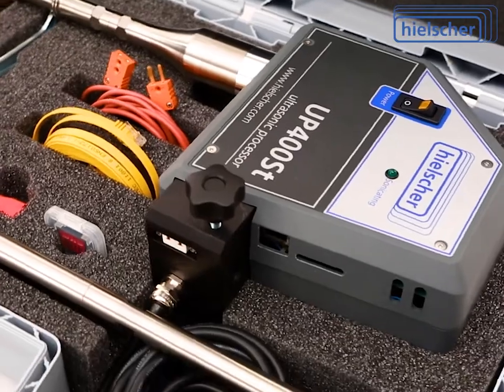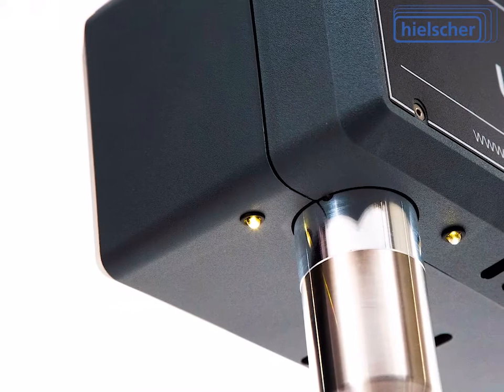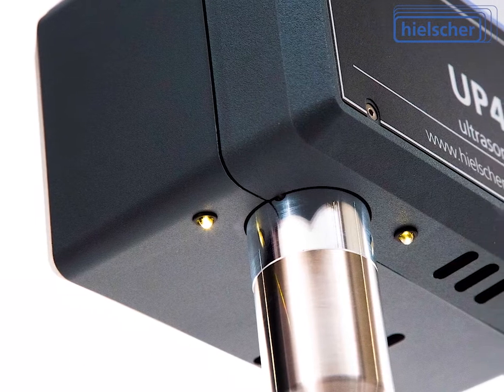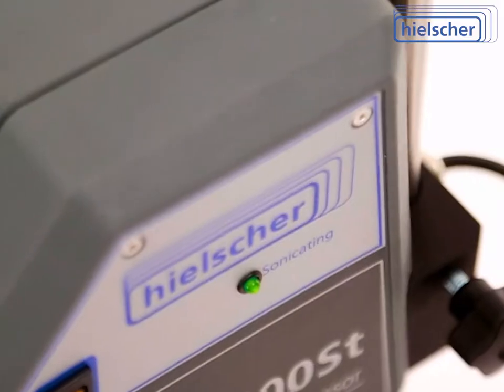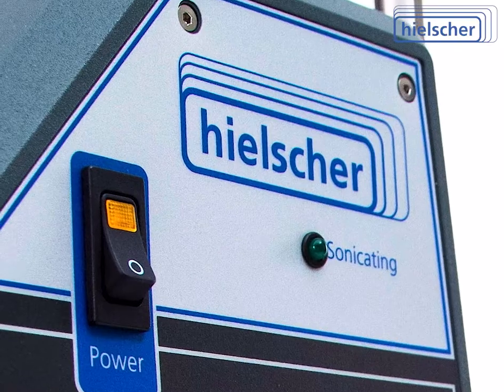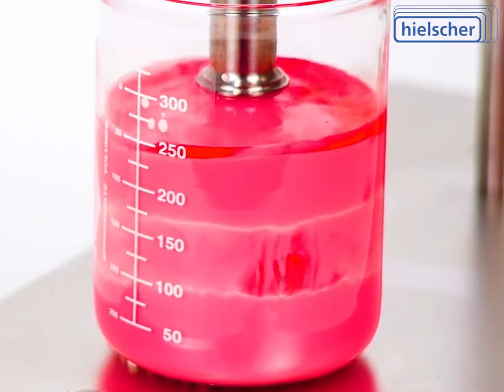It is very compact with a small footprint and uses little table space. The patented sample illumination during sonication improves visual process control and safety. The family-owned Hielscher Ultrasonics GmbH is the most trusted name in the industry of high-performance ultrasonicators.